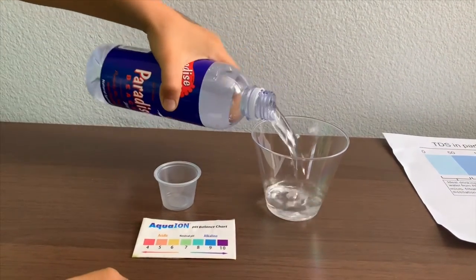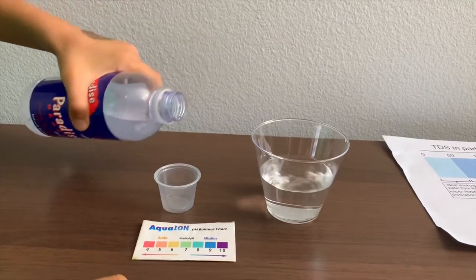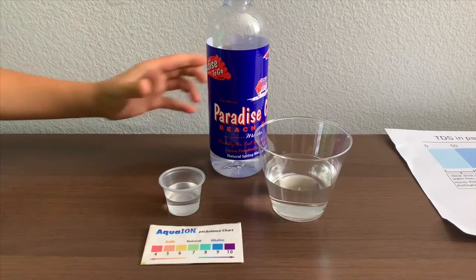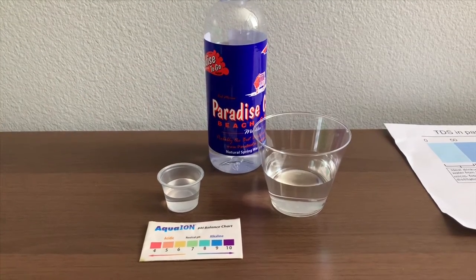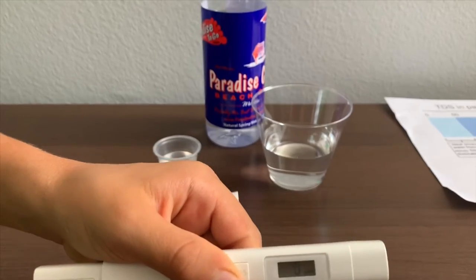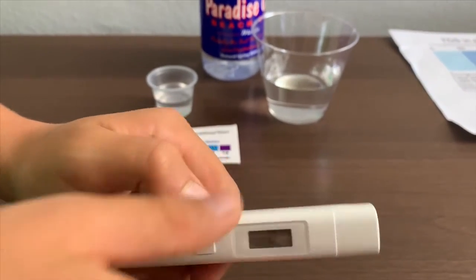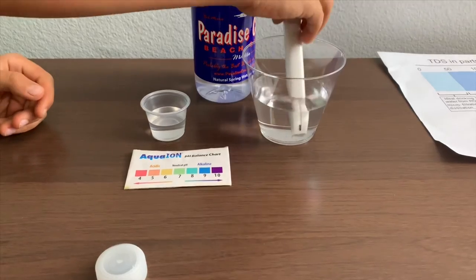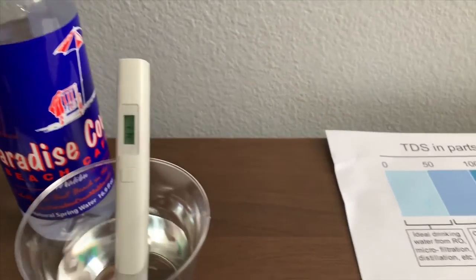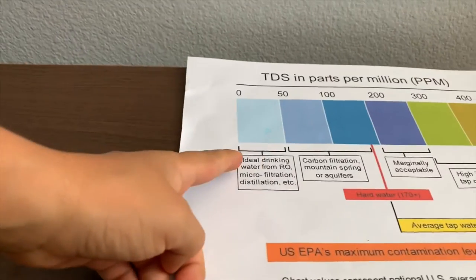Let's pour some water in. First we're going to test the TDS level. If you want to buy this TDS tester, check the link down below. Turn on the TDS tester, make sure it says zero, and put it in. 41 — that is ideal drinking water.